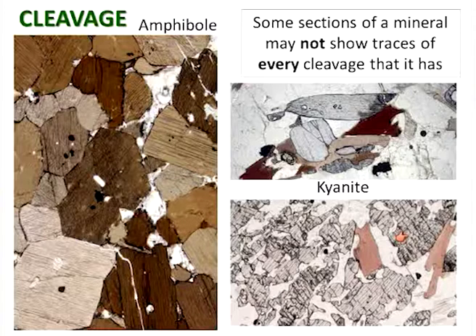But in the bottom one, we've got the brickwork, the classic brickwork kyanite. But even there, it's not really playing ball. It's a pretty horrible skeletal, scattered mineral. This is probably all 1 crystal, in the same orientation, but it's just intergrown with the quartz in a very odd, complex way. So there you can see the 2 cleavages. 1 cleavage running northeast to southwest is very strong. And in some of those bits you've got some cross cracks, almost, they look like, but that is the second set of cleavage planes cutting across from the northwest to the southeast.